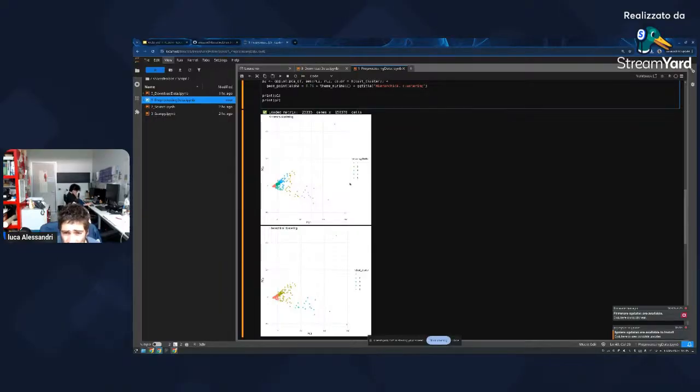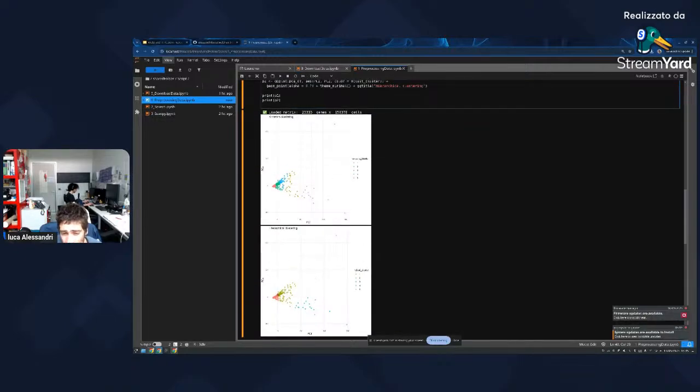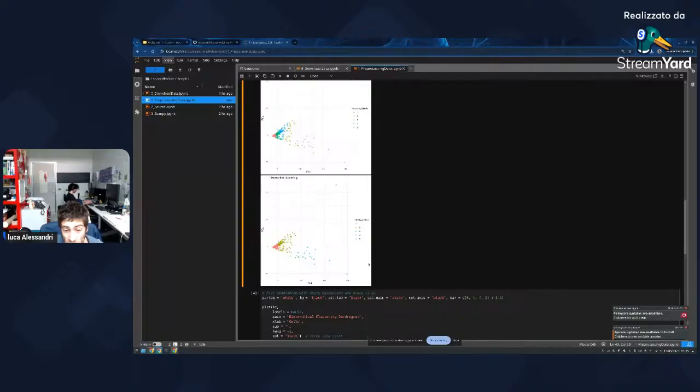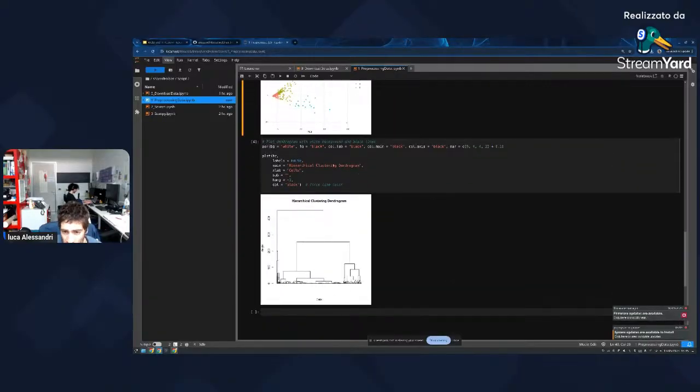So yeah, changing clustering algorithm really changed the results. But as I said before, this is wrong. Indeed, if you have ever seen a single cell RNA-seq analysis, you would have never seen such a plot. I mean, this is an artifact. Here I also plot the hierarchical clustering, the dendrogram, if you want to see a bit more how it divided all of your cells.